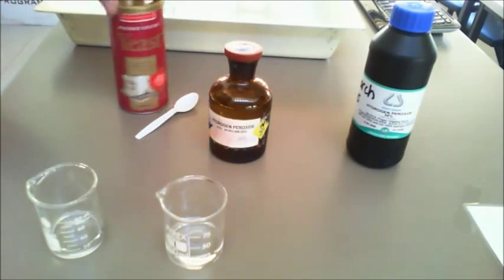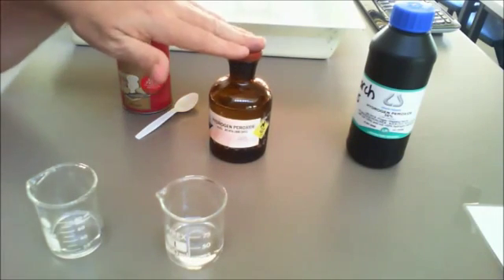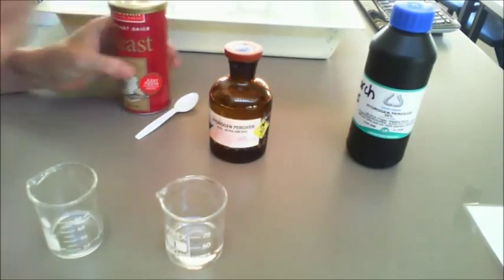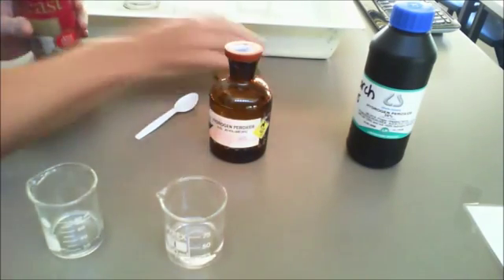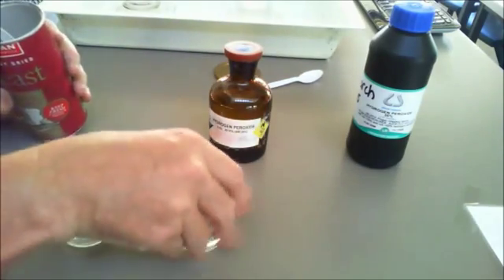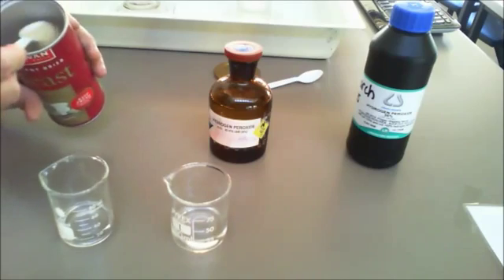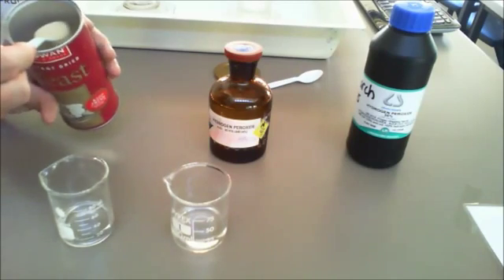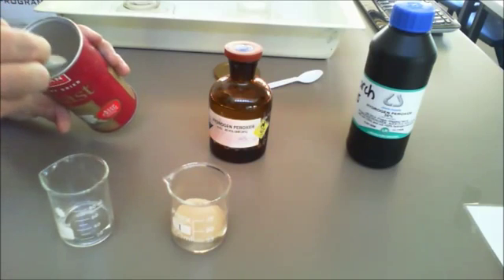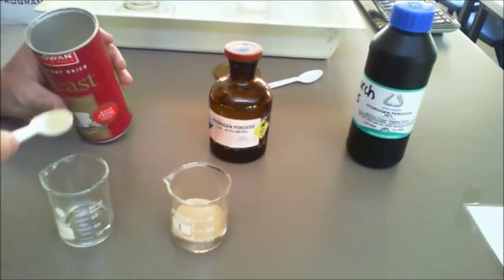In today's practical, we're going to add yeast to hydrogen peroxide to see if we can speed up the rate of the reaction. I've got some warm water here to activate the yeast. In one, I'm going to put a full amount of yeast, and in the other, only a very small amount of yeast.